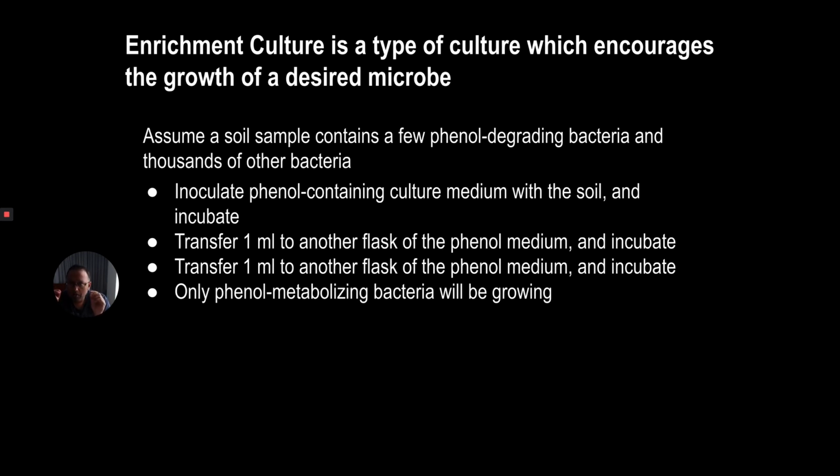So what I can do is I can take some soil sample and create a phenol-containing culture, right? So I have a culture tube, and in that culture tube, I have phenol. That's the only thing that a bacteria in this environment can eat, right? I add my soil sample, and I incubate it. Theoretically, there may be a few bacteria in that soil that don't eat phenol, but I'm not giving them anything to eat, but I'm also not killing them, right?